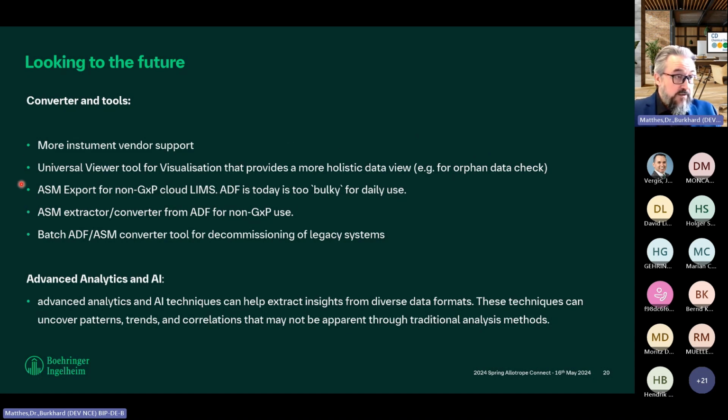Some other things we also heard today, ASM export for non-GxP cloud systems. That's something I think all of the larger pharmaceutical companies are working on, some kind of a cloud system that provides access to all analytical data or process data that is generated. ADF is too bulky for the daily use.